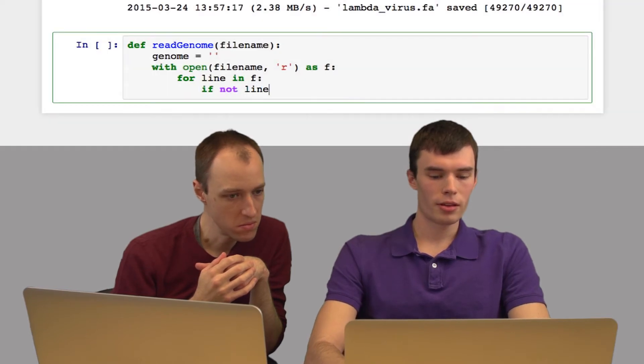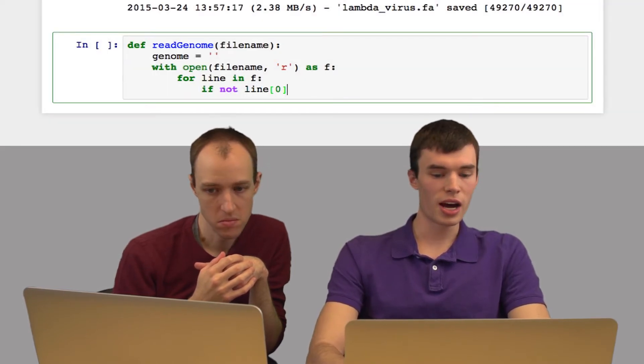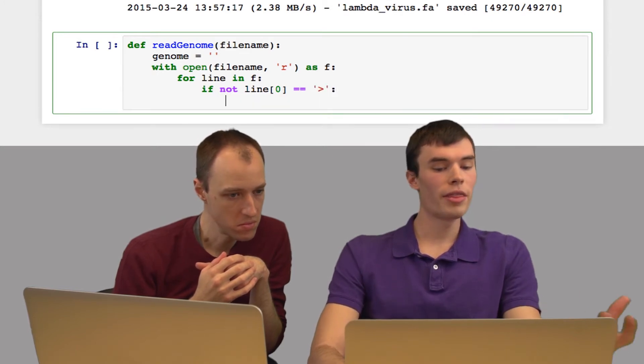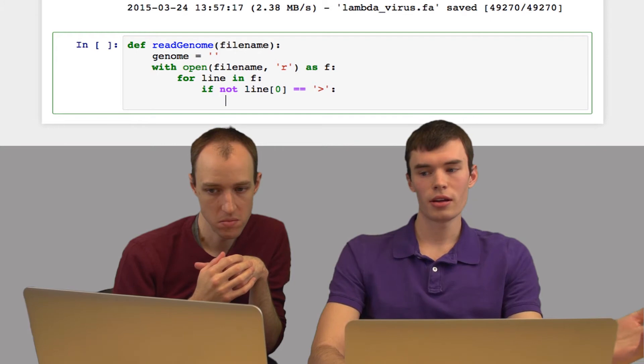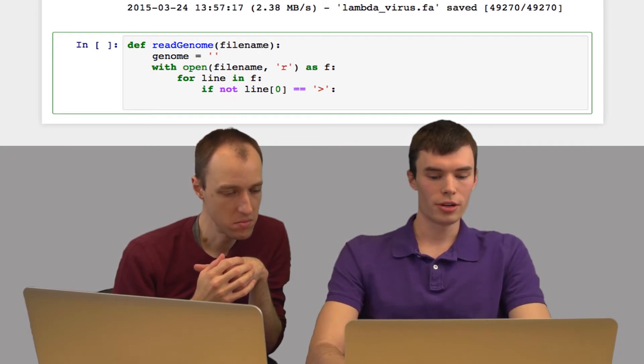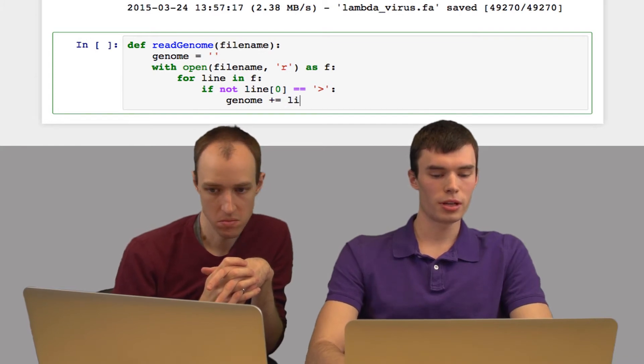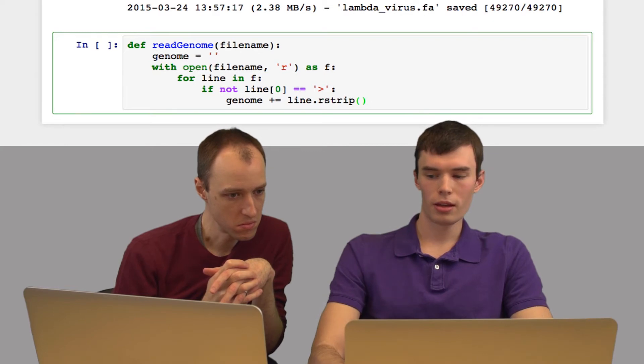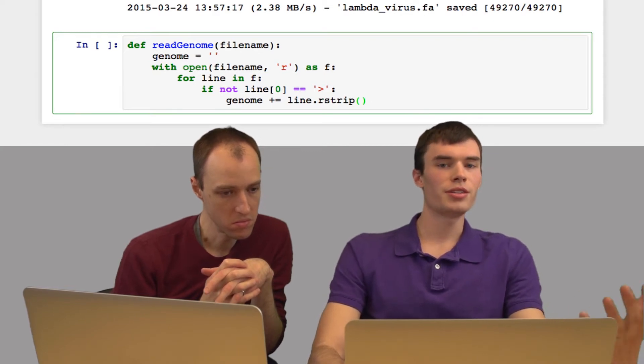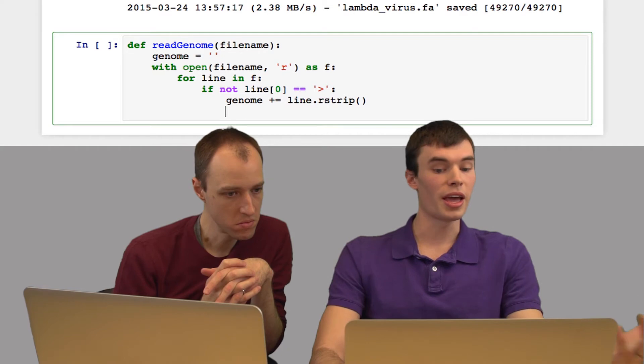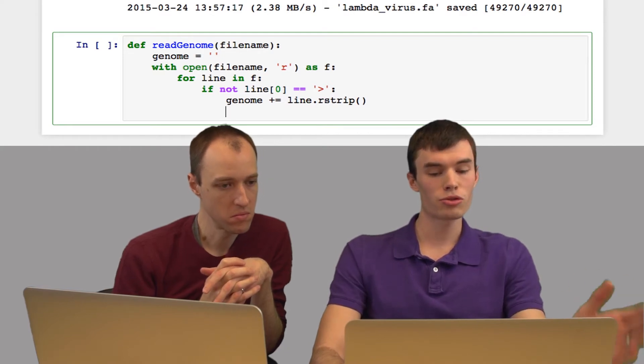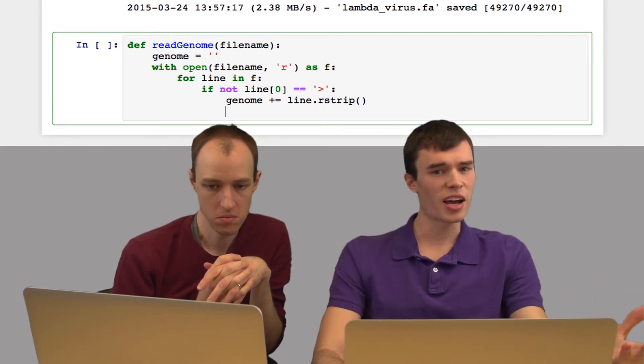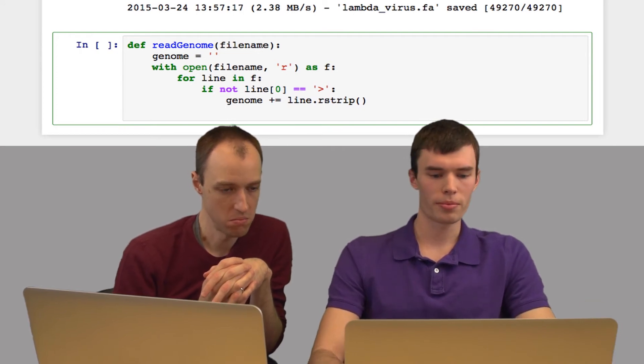So the first thing I need to do is if it's the first line of this file, which starts with an arrow, we want to ignore that. That just has information that we don't really care about. So I'm going to say if the first character in the line is not the arrow, then it must be a line containing bases. So in this case, I'm going to add it onto our genome string. So I'm going to say genome plus equals line dot rstrip. And what rstrip does is it removes any trailing white space from the ends of the string. So in this case, it will trim off the new line at the end. If there are spaces, tabs, any other white space, it will also trim those off as well.